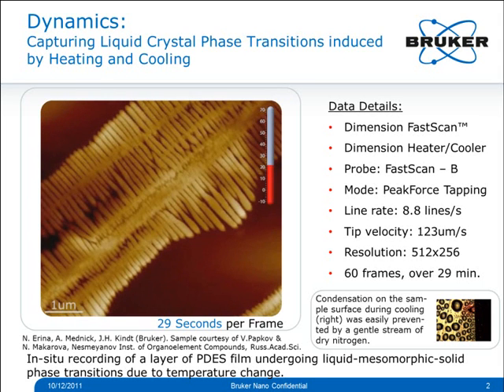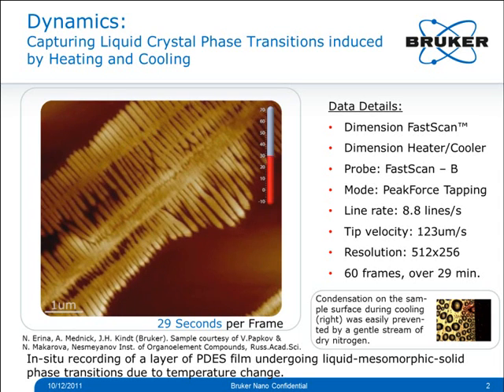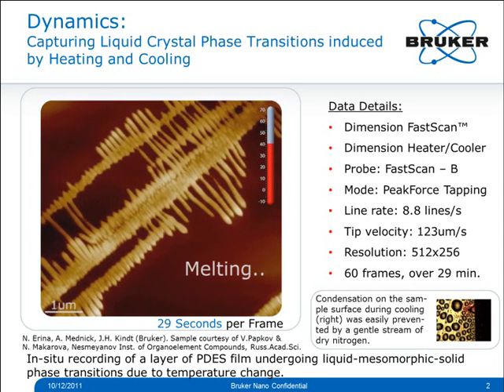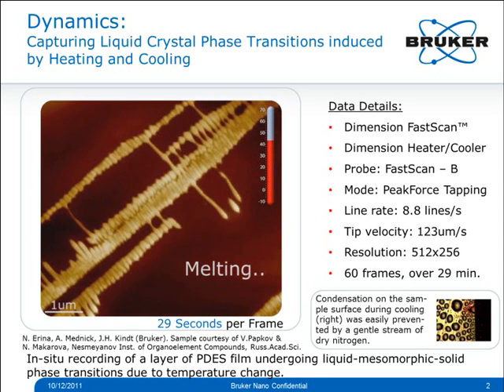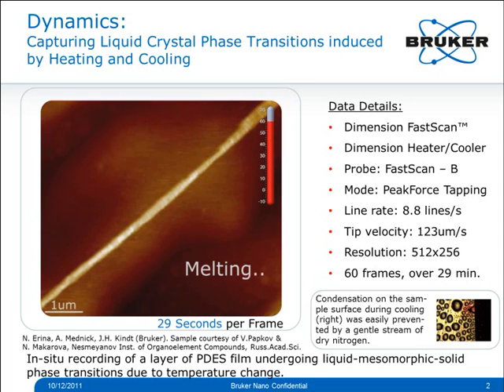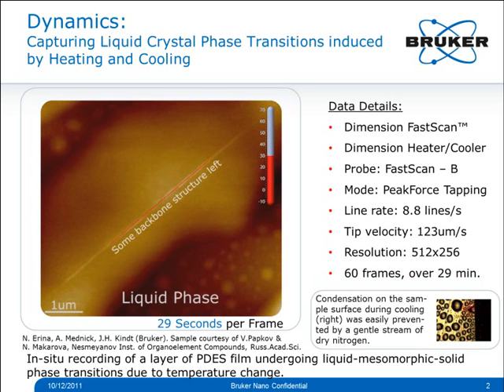The backbone can be seen and there are seagull-like structures described in the literature which are perpendicular to the backbone. Now the heating starts and the seagull-like structures are starting to melt. At this point only a little bit of the backbone is left and the rest of the material is liquid as it is being cooled down.